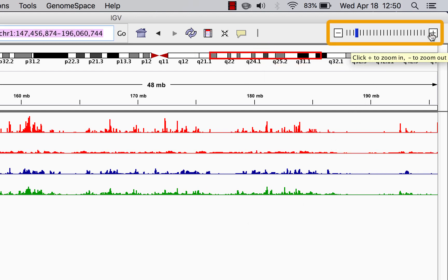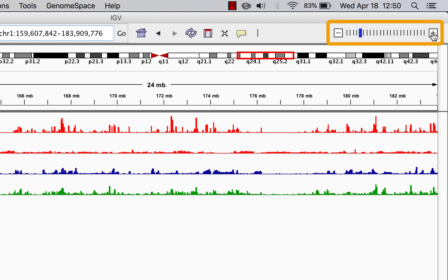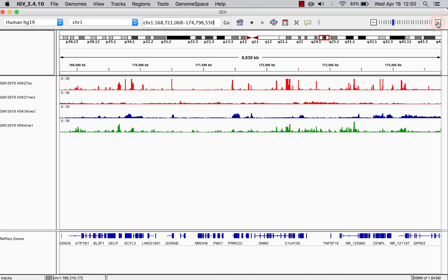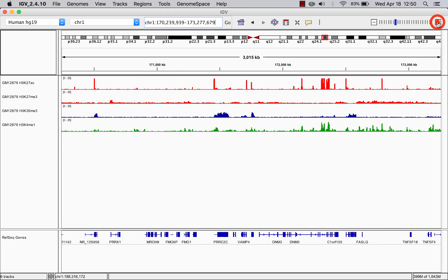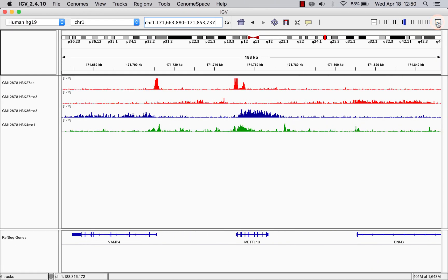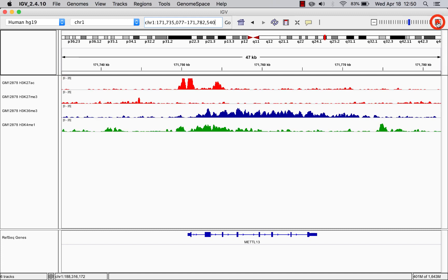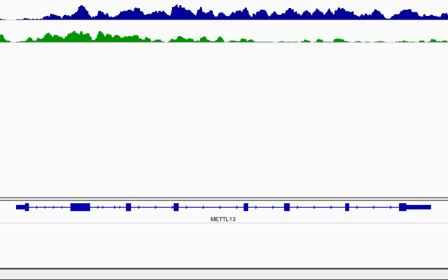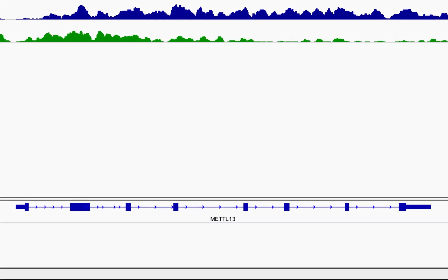To zoom in even further, you can use the zoom tool in the upper right corner. As you zoom, you'll be able to see individual genes like this one.